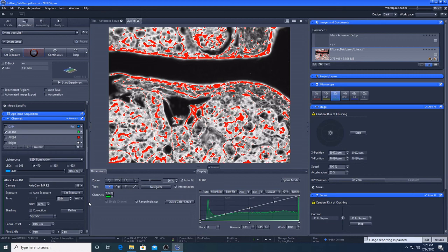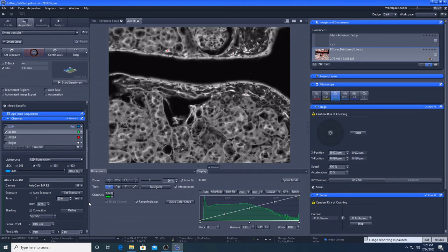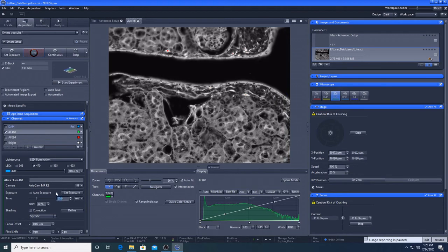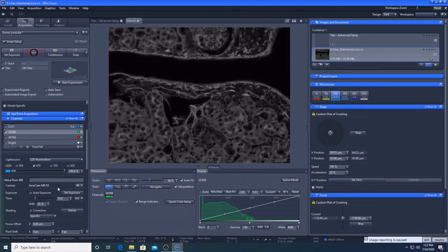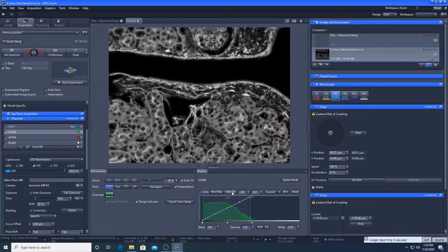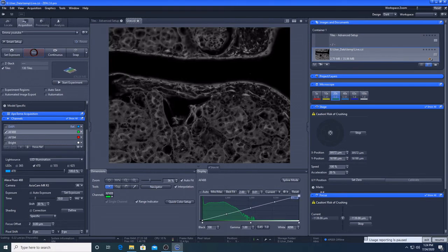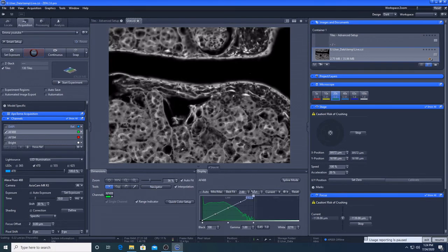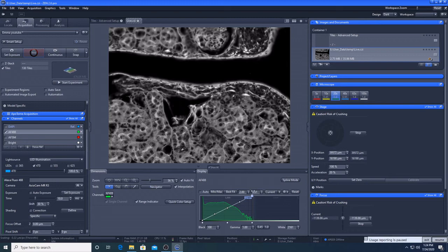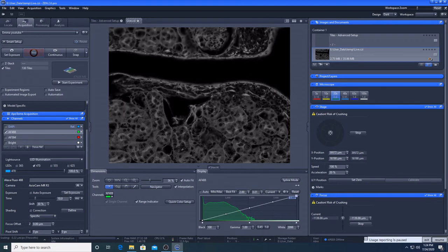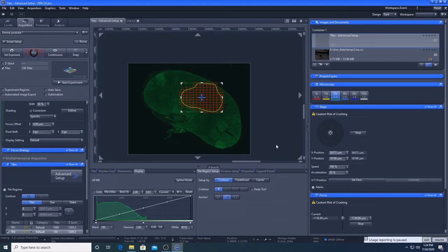So let's go to 20. And then, still got a little bit of overexposure there. So that's how it actually is. That's still a good detailed image there. Just filling up half this range. That will be fine. So go back to our tiling.